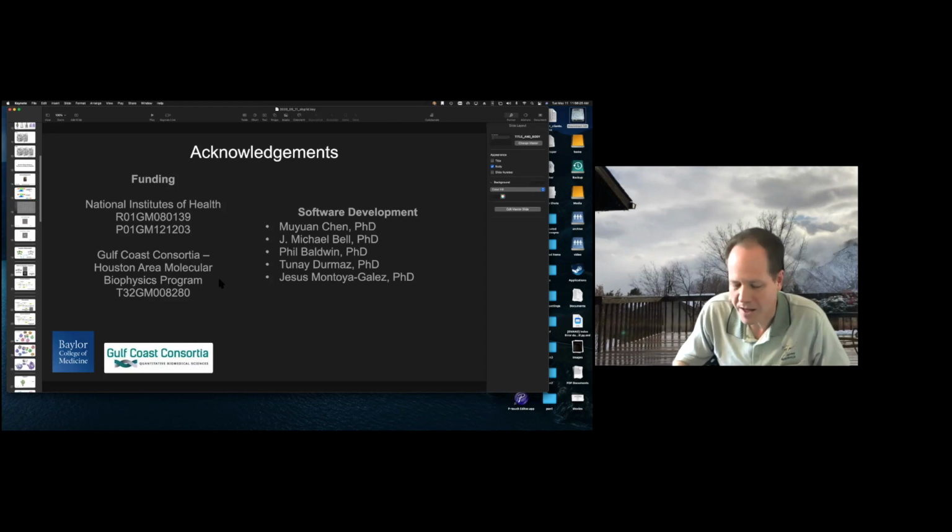Of course, we have all the intermediate releases and stuff like that, but I don't think we're going to do another release in the EMAN2 series. You'll note that it went from 2.3 to 2.9, sort of indicating that the current release is like a preview of some of the stuff that we're going to be putting into 3. Yeah, it's my best guess.